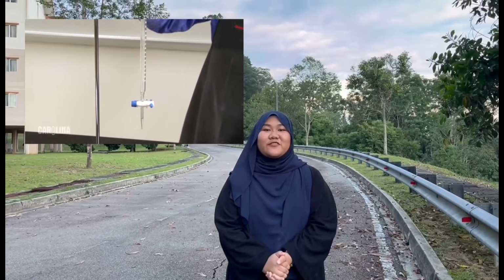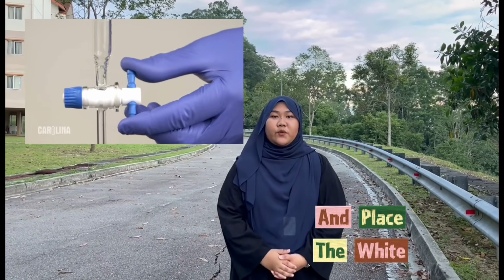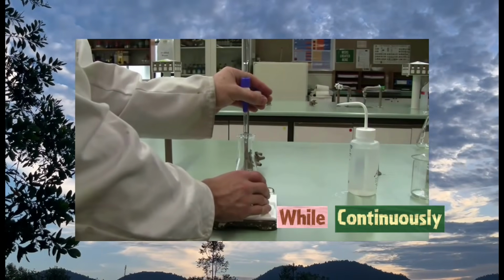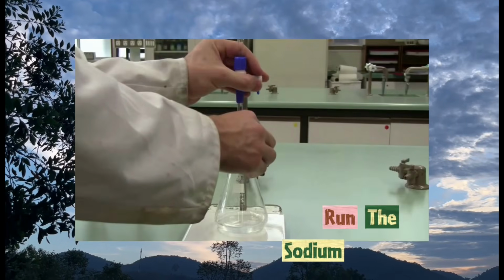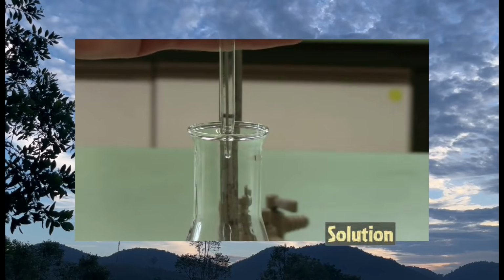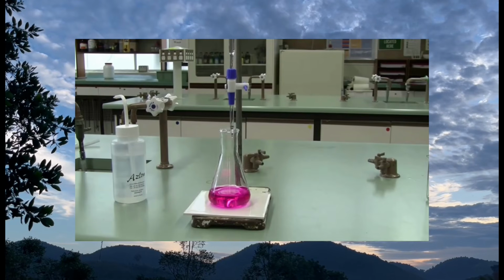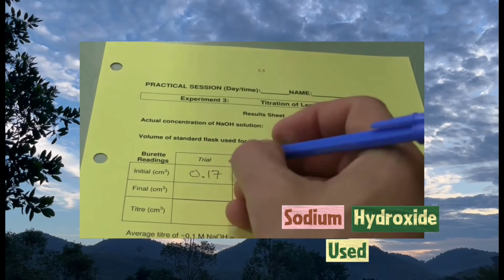Next, place the conical flask under the tip of the burette and place the white tile under the flask to make it easier to see the color change from colorless to pink. While continuously swirling the flask to ensure thorough mixing, run the sodium hydroxide solution from the burette. Continue adding sodium hydroxide solution drop by drop until the color changes from colorless to pink. Read the final volume on the burette and write the volume of sodium hydroxide used in your data table.